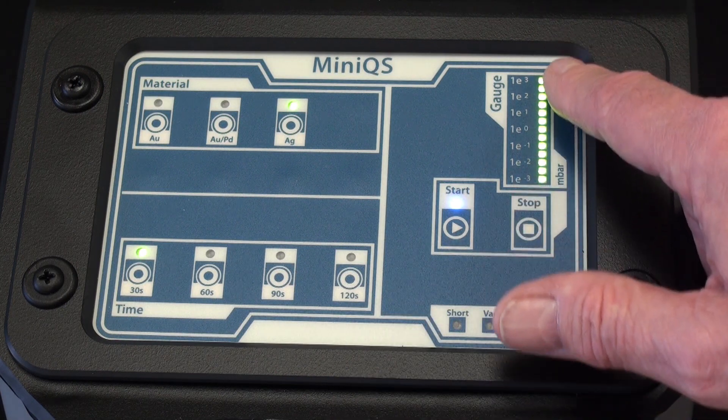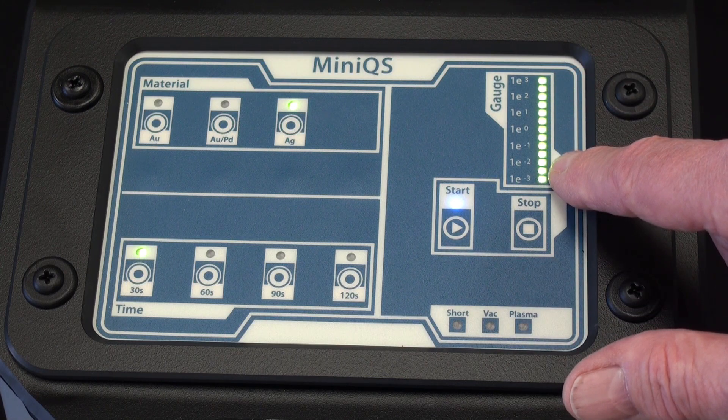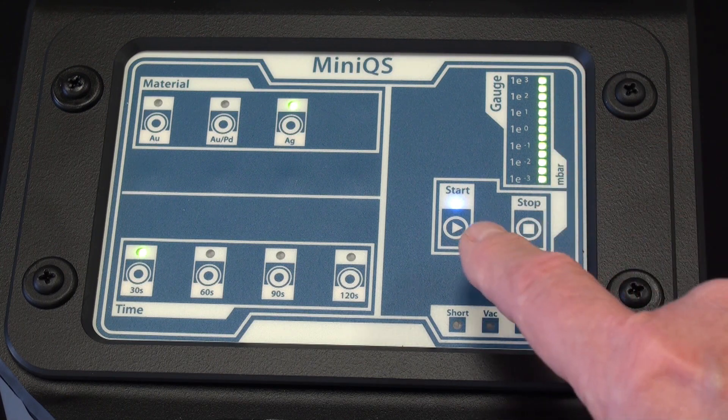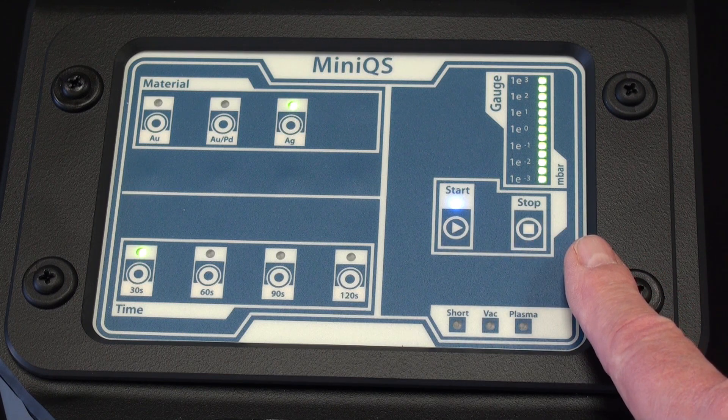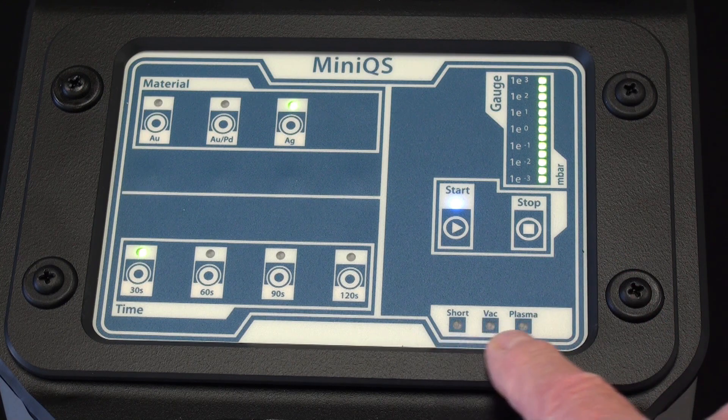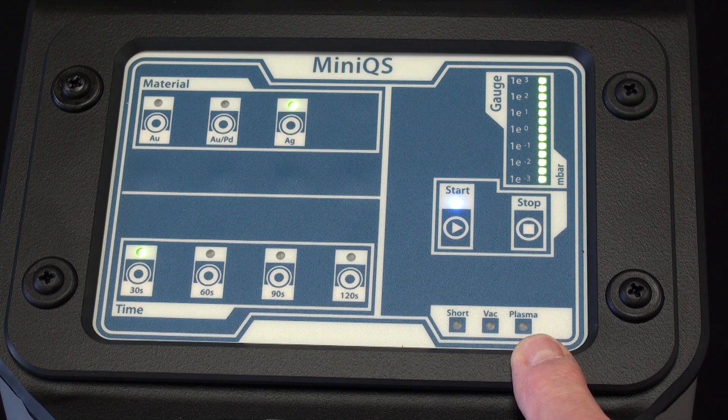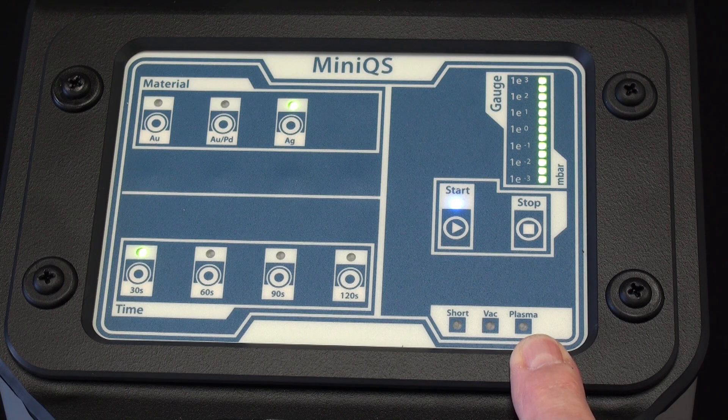Over here we have the vacuum meter, so this is atmospheric, as it goes down it gets to a higher vacuum. And we have a simple start/stop button which puts the instrument into function. Then we have three indicators down here which indicate a fault condition exists.